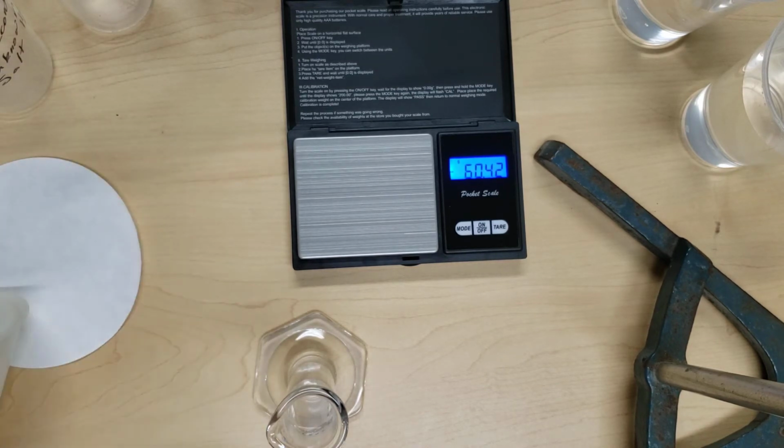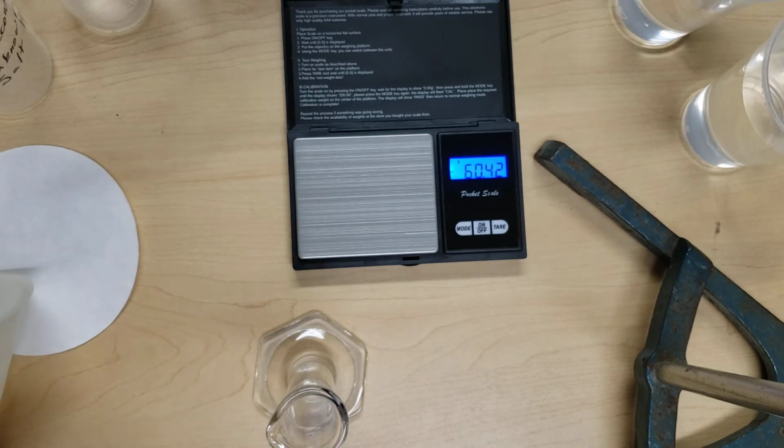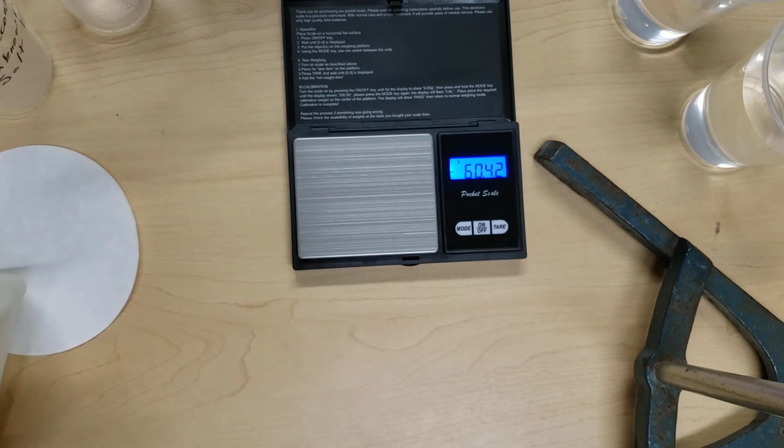We are also going to be using sand, and the exact amount isn't essential, but you want to add about 5 milliliters of sand to your graduated cylinder. Got a little carried away there.